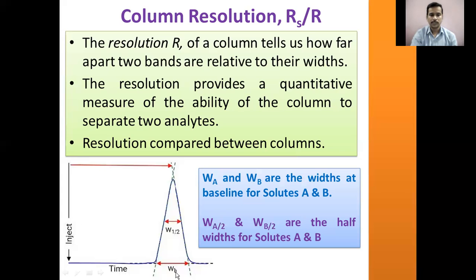So you will have a mobile phase peak, from which we will get the value of Tm, and we will have the solute peak, from which we will get the retention time. The retention time can be obtained by projecting the peak point onto the x-axis. The retention time is the time taken, after the sample is injected, to reach the detector. So this is the usual chromatogram.